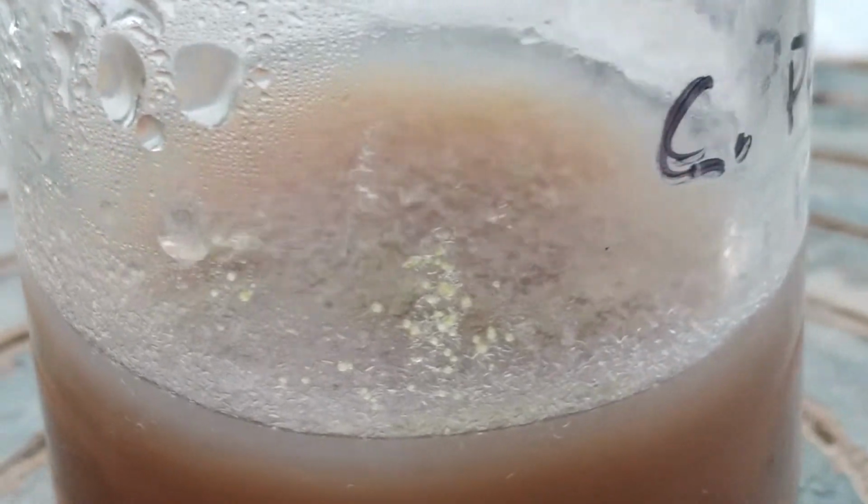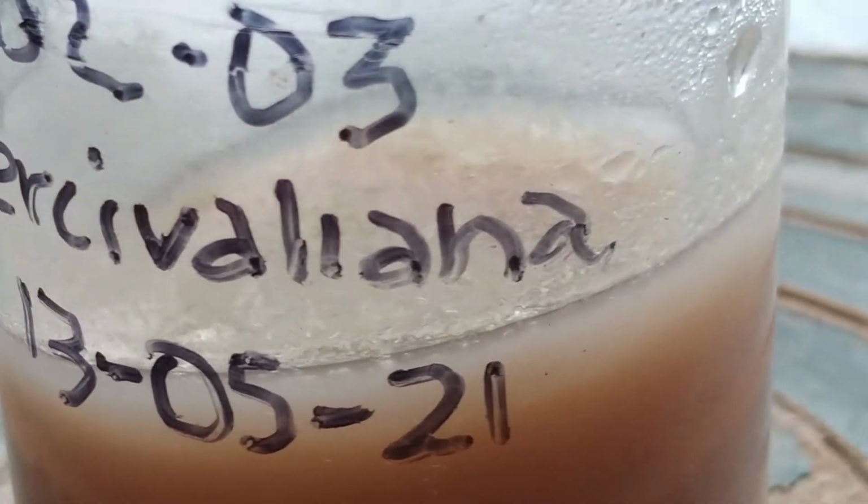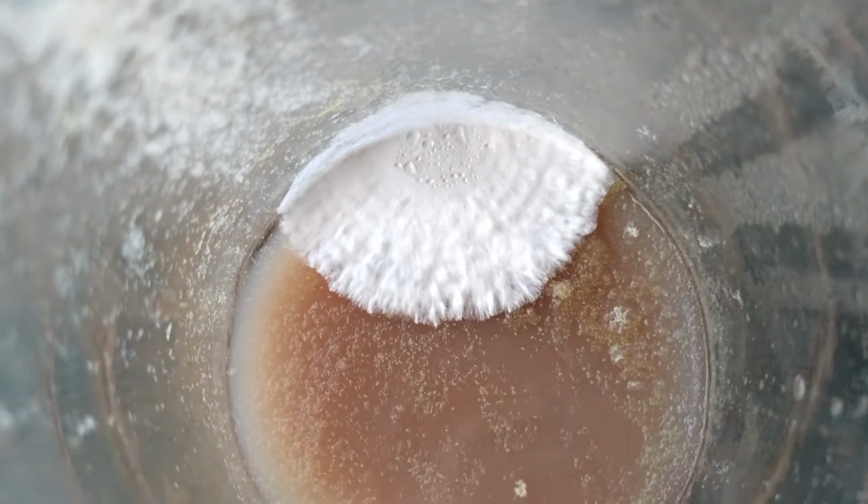But the in vitro method that we're going to talk about is very different. We use a gelatinous medium, super sterilized and super nutritious, full of minerals, sugars, and other substances the seeds need for germination. But the super nutritious medium has its drawbacks too, because not only the seeds will love it, bacteria and all sorts of fungi will take it for a banquet. The jars with the seeds get contaminated by molds and bacteria very easily. Even when we're outrageously careful, a few of the jars always end up contaminated.